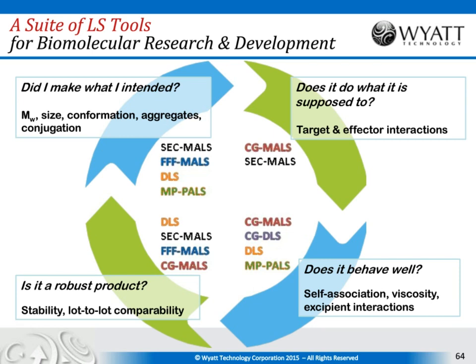If you're looking at a typical antibody-antigen interaction with KDs of sub-nanomolar and up to tens or about 100 nanomolar, you're going to be using 100 to 200 micrograms of each protein. If the interactions are weaker and you need to measure higher concentrations, then you're going to be using more material. So if you're in the micromolar range, you might be using a couple of milligrams of material. It turns out that it's comparable or slightly less than standard ITC and a little bit more than standard SPR.